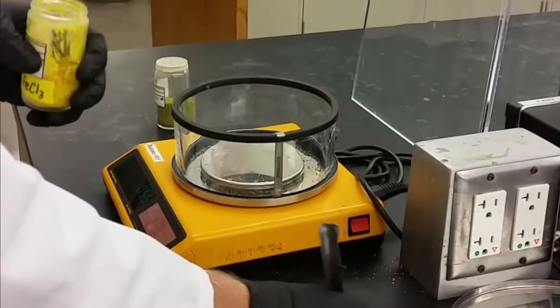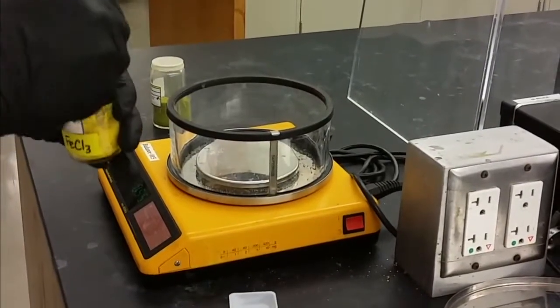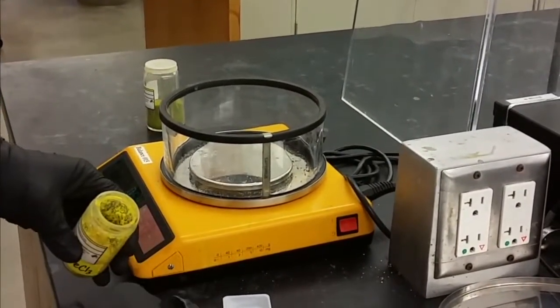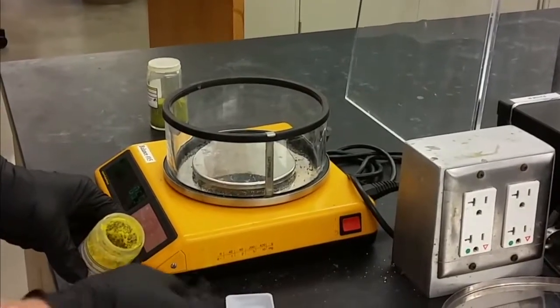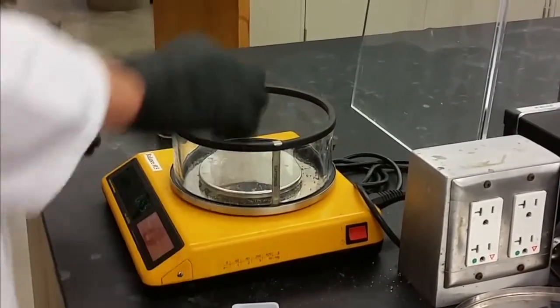In setting up this lab, the first thing you have to do is measure out the proper amounts of iron three chloride hexahydrate and iron two chloride tetrahydrate. This is a chance for you to put into practice what you learned when you passed off this skill.